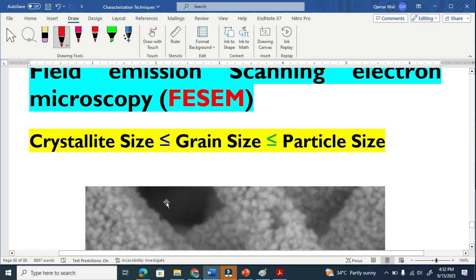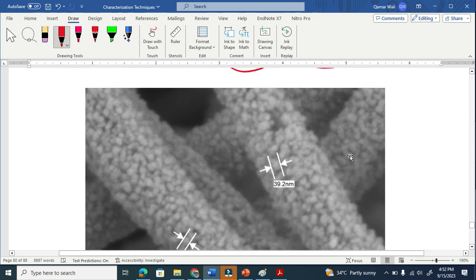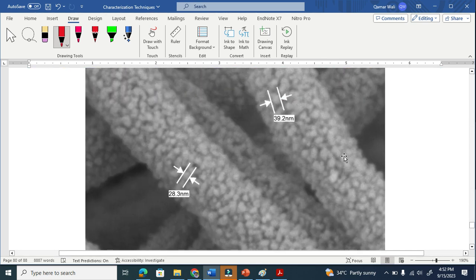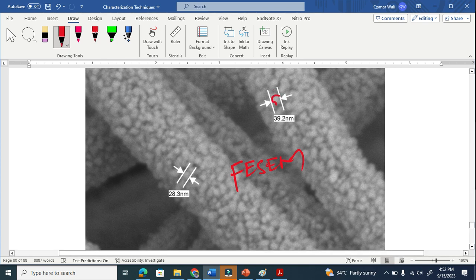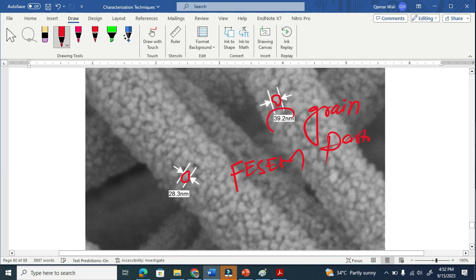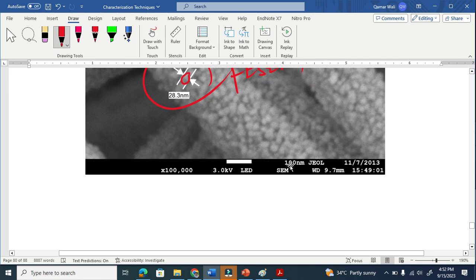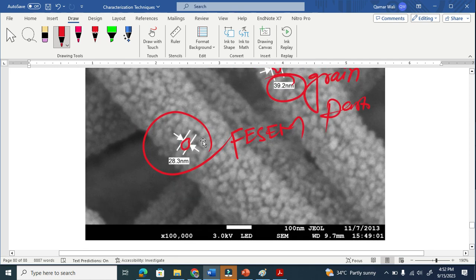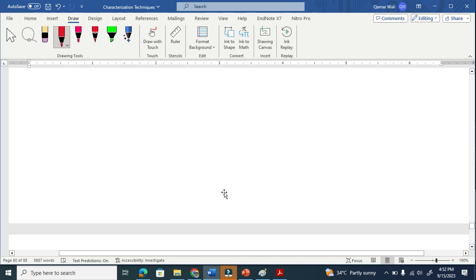In nanometers, you can also calculate the crystallite size, grain size, or particle size. Look here — this is the SEM, the FESEM image. You can see this is basically a grain or particle. We can easily see that the size is below 100 nanometers. SEM can help us to detect nanomaterials. You see the scale is 100 nanometers, so these grains or particles are very very small.